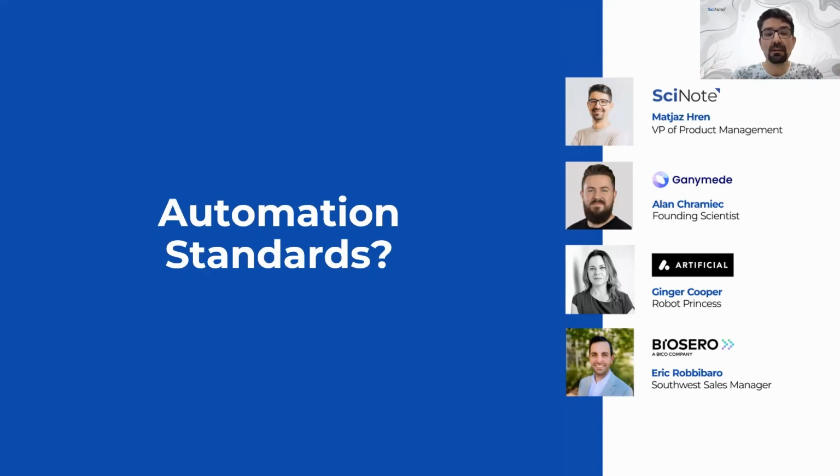That every platform tries to add some additional benefit or functionality. And maybe the last part that I want to mention, so the third attempt of standardization, are the vendors, the instrument vendors themselves. They are building IoT platforms that are typically quite closed.